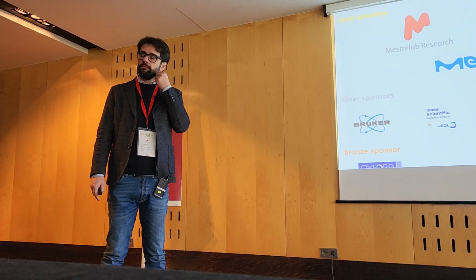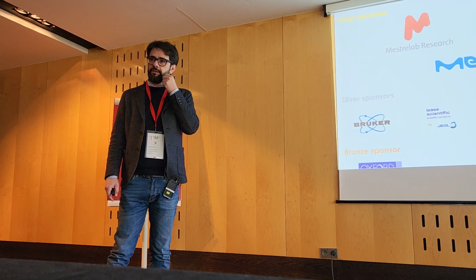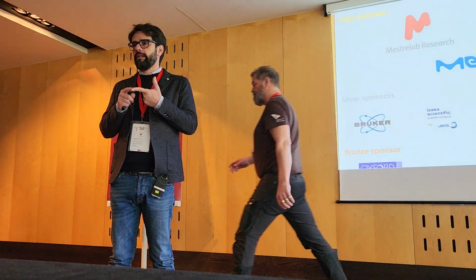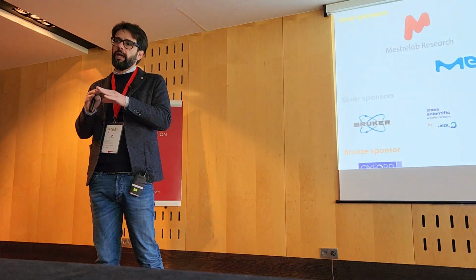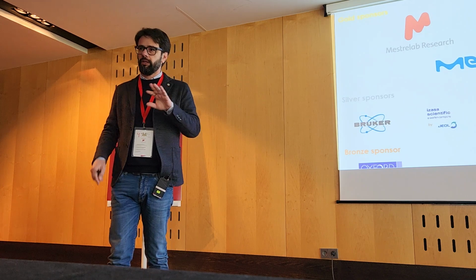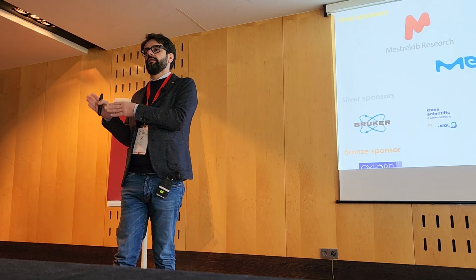Well, I think my question goes in the same direction, coming more from the acquisition side. Did you give parameters that should be used for the acquisition? Yes, we gave the sample, and we gave the acquisition parameters for each magnetic field. So everything was harmonized. The acquisition part is harmonized for every magnetic field. What is still not harmonized is the processing part.